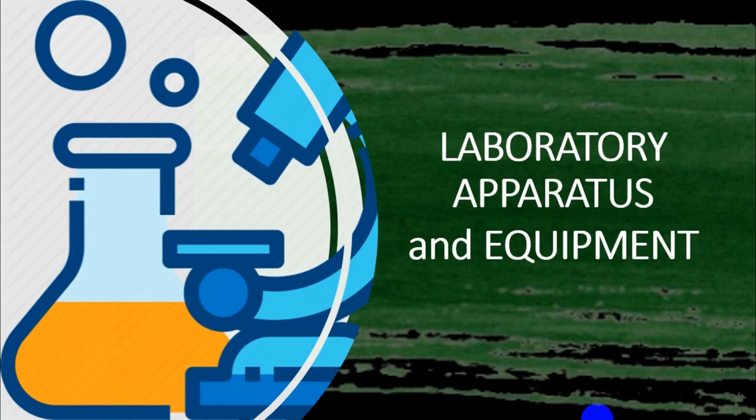When performing an experiment or activity in the laboratory, to investigate or verify a certain concept or principle, you use laboratory apparatus and equipment. In this video, still as part of your preparation for the A&E test or for whatever test you will take, we will review the common laboratory apparatus and their uses. Some of the most common kinds of laboratory apparatus and equipment can magnify, measure, ignite, weigh, or hold various substances for a variety of purposes.